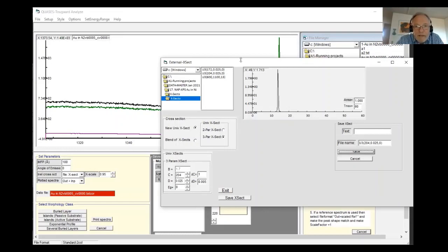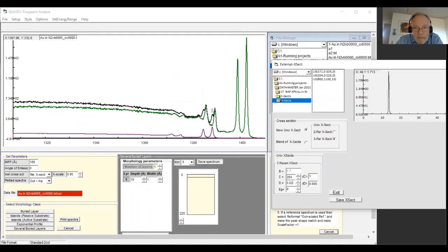So now we have these three cross sections, and you see this peak takes care of this peak and takes care of that peak, takes care of these two peaks more or less. So we have multiple scattering here, double and triple. So we're left now with the peak here that's not accounted for. And this doesn't have a corresponding peak out here corresponding to these two. So this must be the peak that corresponds to this peak, whereas the other peak corresponds to that will be in here somewhere, so we don't see that clearly. So we just fit to this peak out here.